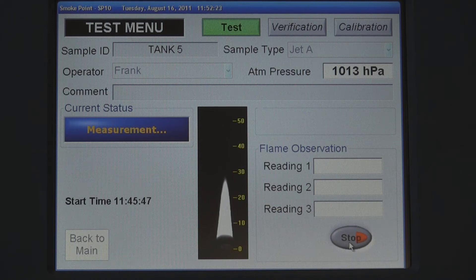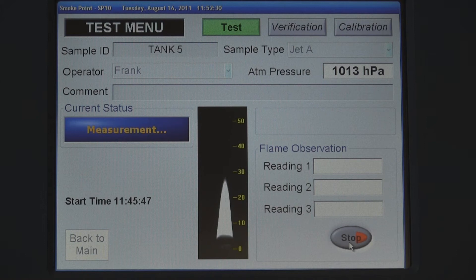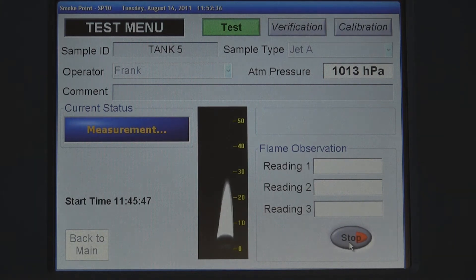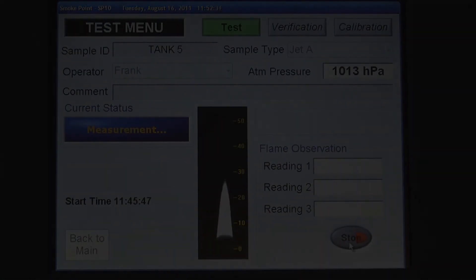An open flame is no longer required in the laboratory. The reduction in labor cost is over 45 minutes per sample. The SP10 provides a fully documented and traceable test result, and a technician can also verify each measurement visually.